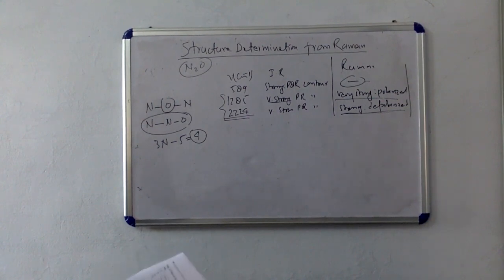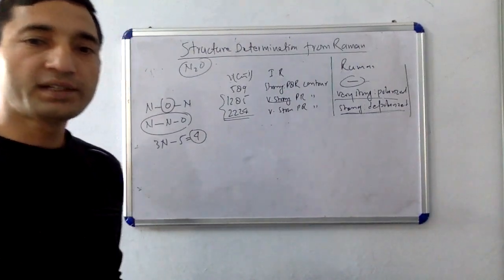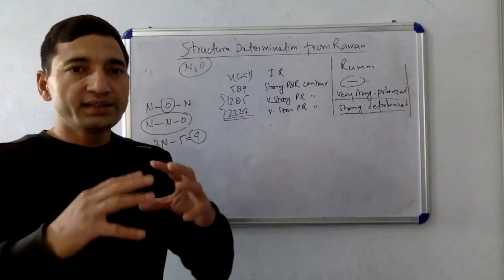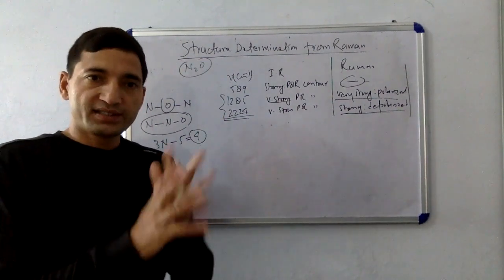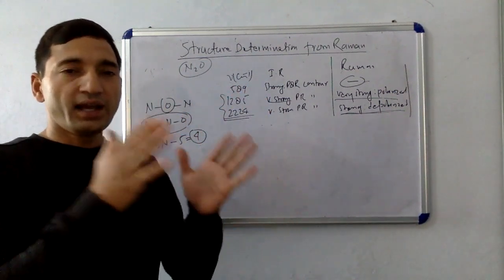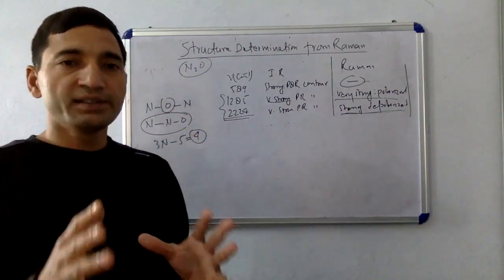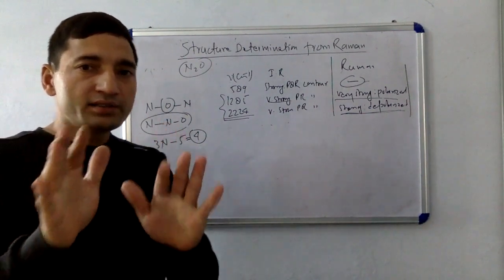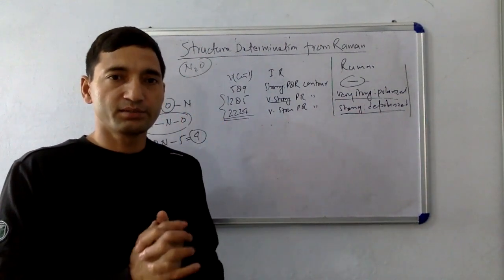We can take more complicated and valuable cases later. When we consider IR spectroscopy as well as Raman spectroscopy, it is always easier to find out the structure of molecules. As I have said repeatedly, Raman spectroscopy in conjunction with IR spectroscopy provides an essential tool to determine the structure of molecules. Here polarization is useful, but certainly not essential to find out the structure of the molecule.